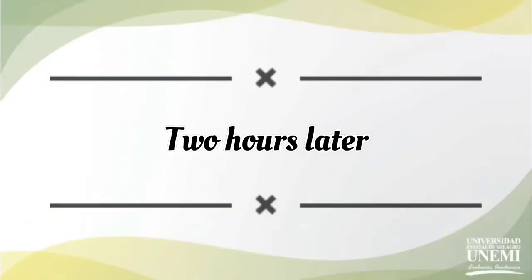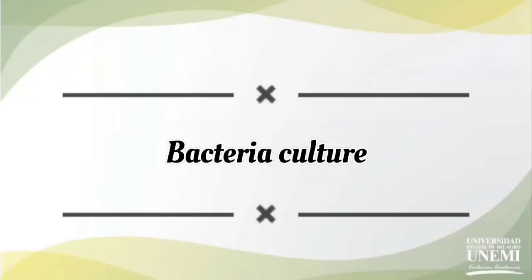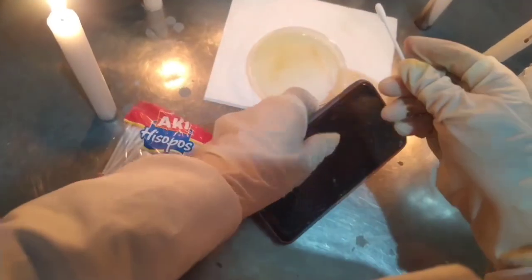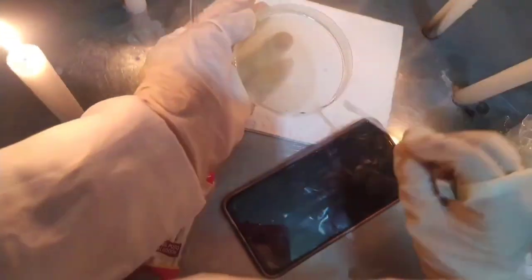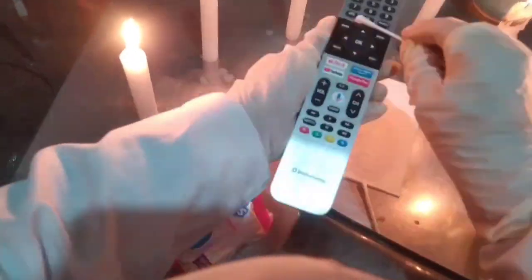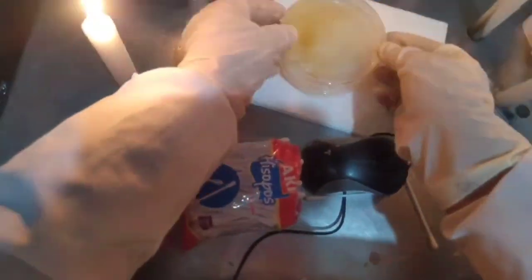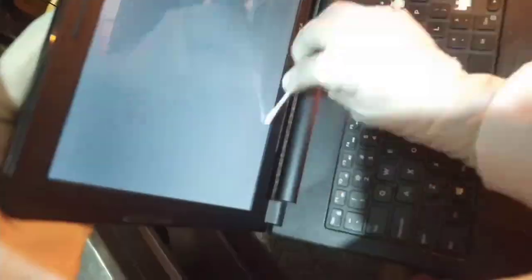Two hours later, we re-sterilize our work table and unpack the dishes. Then, with a cotton swab, we are taking a sample from different objects and culturing it on our agar culture medium.